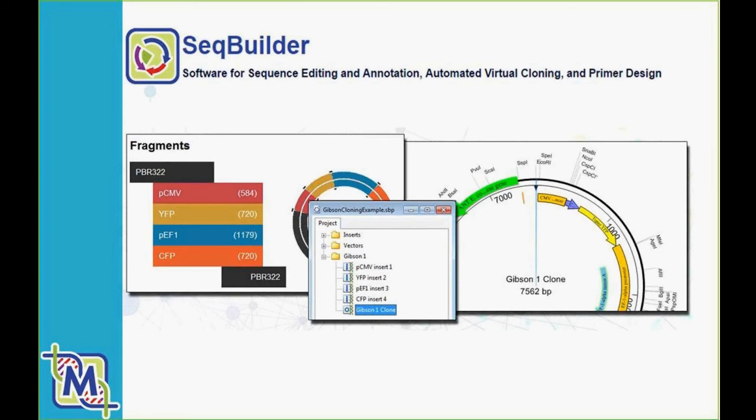The addition of the automated virtual cloning tools is a strong addition to the application. We have essentially created a tool that makes cloning as easy as 1, 2, 3, where 1 is preparing your insert, 2 is selecting your vector of interest, and 3, obtaining results. This can all be done in a matter of seconds. Let's jump into the software to show the enhancements.